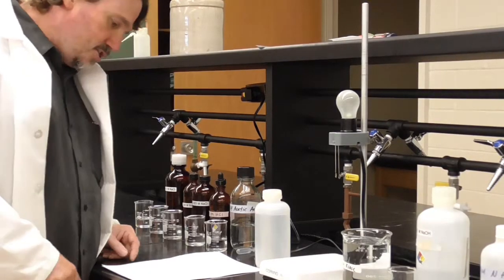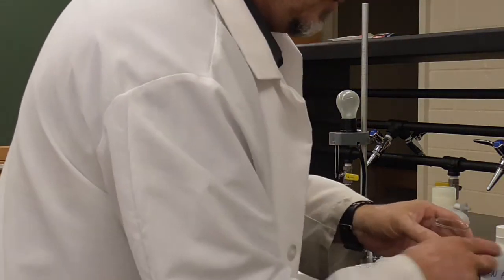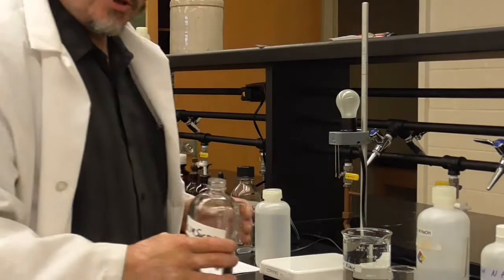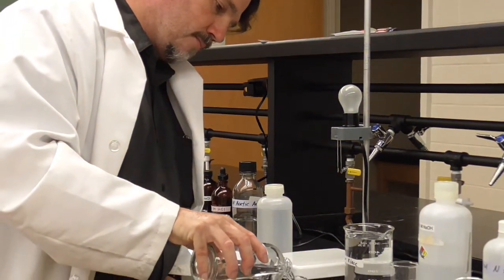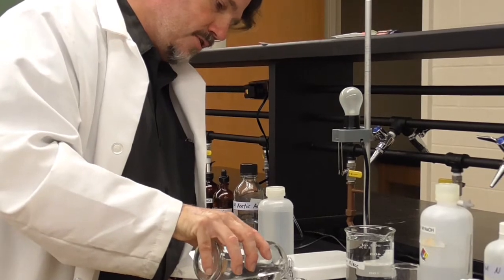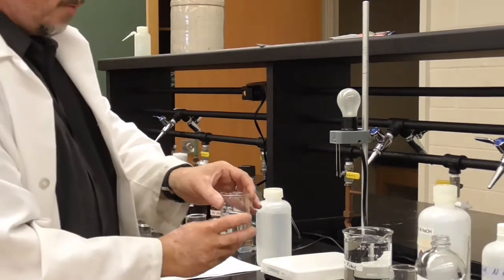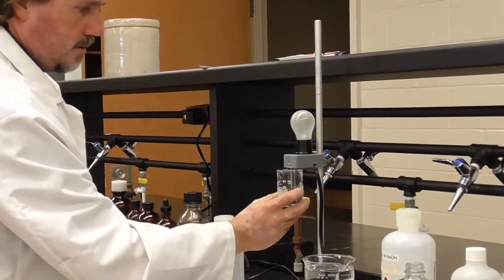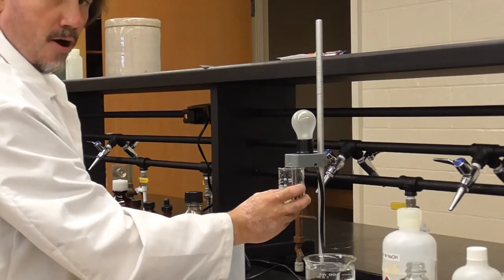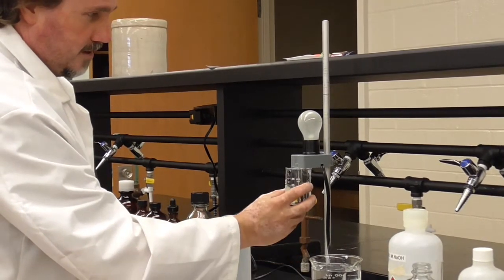Okay, next on our list is 0.1 molar sucrose. And here's sucrose, 0.1 molar, same concentration as before. Sucrose is table sugar. Stuff you put in your coffee, your tea, or you bake cookies with, that kind of thing. So here we go, 0.1 molar sucrose. Put it up there, and nothing at all. Nothing at all. That is a non-electrolyte.